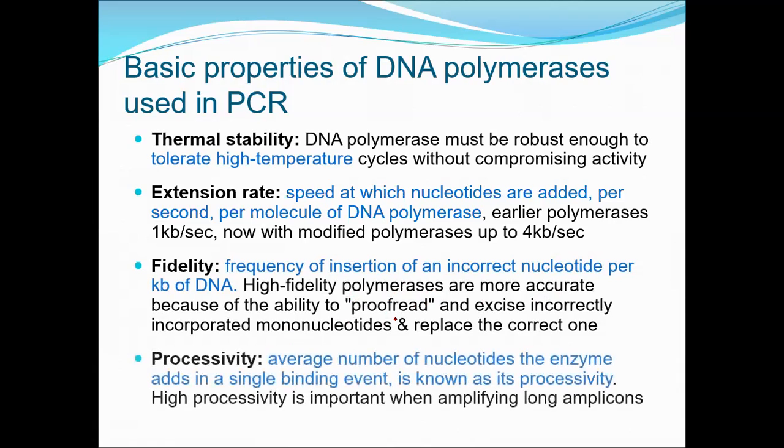And the last one is processivity. Processivity means the average number of nucleotides the polymerase adds in just one binding event with the template. So high processivity is very important for amplifying the longer DNA fragments.